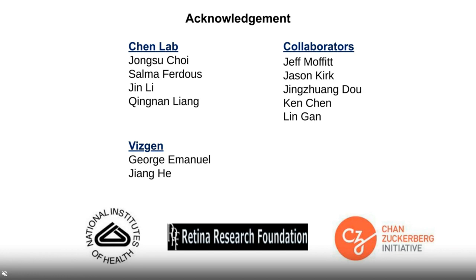Thank you. Next question. Regarding the retinal preparation, have you tried flat mount or only cross-section? So far, we only tried cross-section. We actually tried once with the flat mount. I think there's a lot of challenges there, because of the imaging, and also how do you, when you prepare the slide, move the tissue over. But based on our one-time try, we think it's possible, but definitely some optimization is needed to do that. Okay, thank you. Next question.